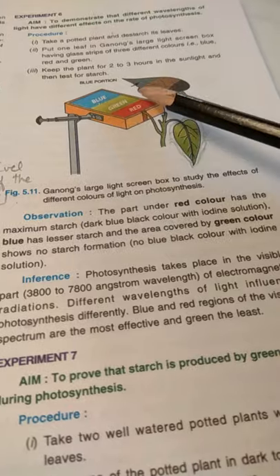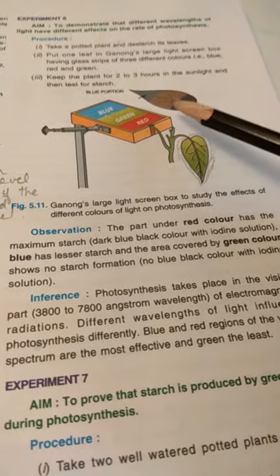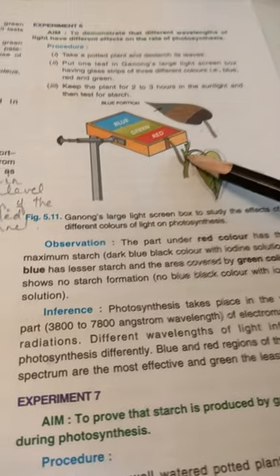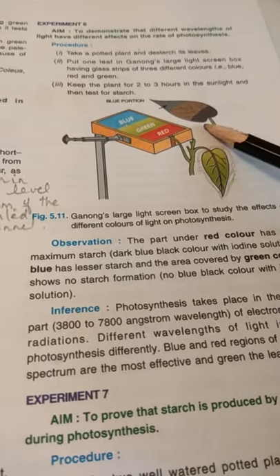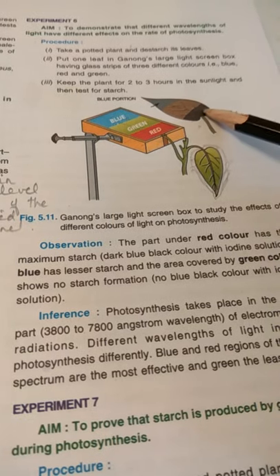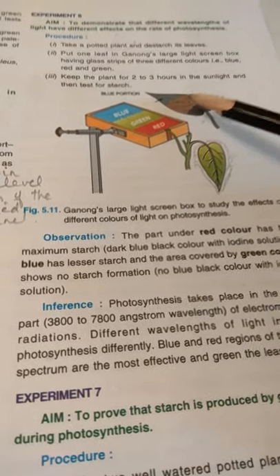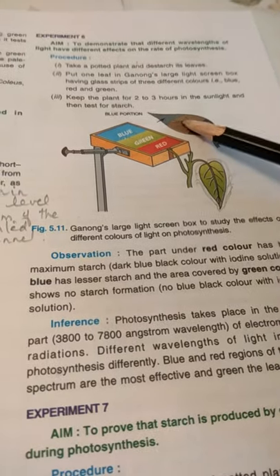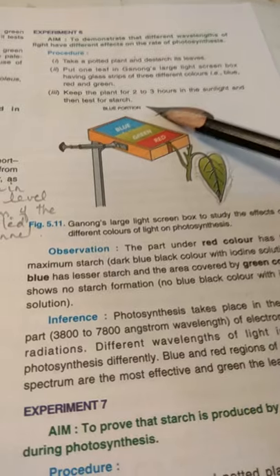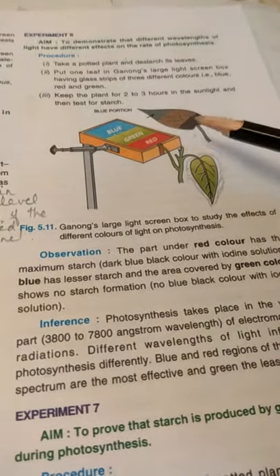We take out that leaf and perform the starch test — boil it in hot water, then in methylated spirit to remove chlorophyll. Then we apply iodine. The area where the red glass strip was turns blue-black in color, showing the presence of starch. The middle area with the green glass strip turns brown with iodine — no starch formation. The area under blue color shows only a slight change, indicating less starch formation.